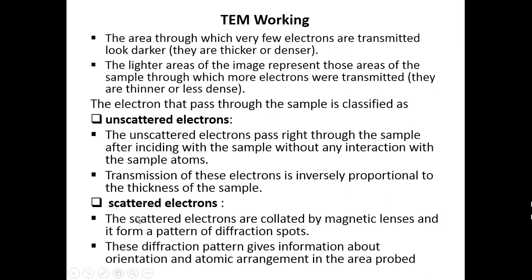What about the scattered electrons? The scattered electrons are collected by magnetic lenses, and they form a pattern of diffraction spots.